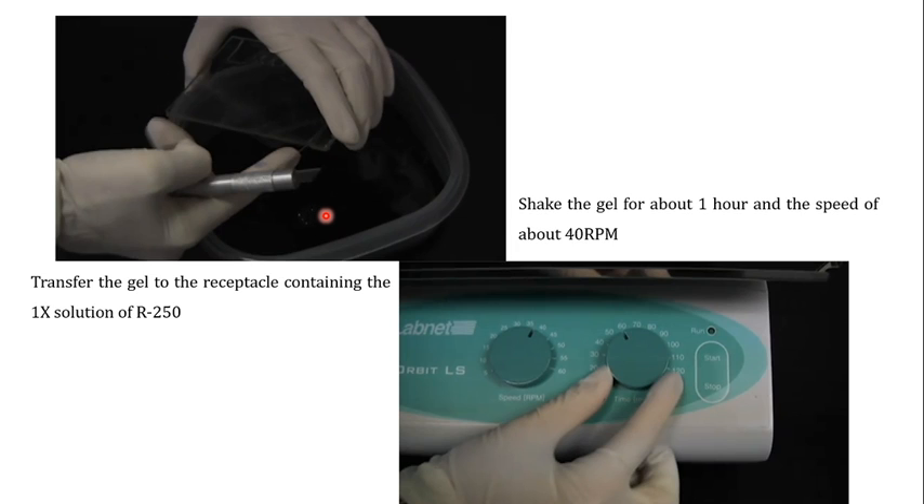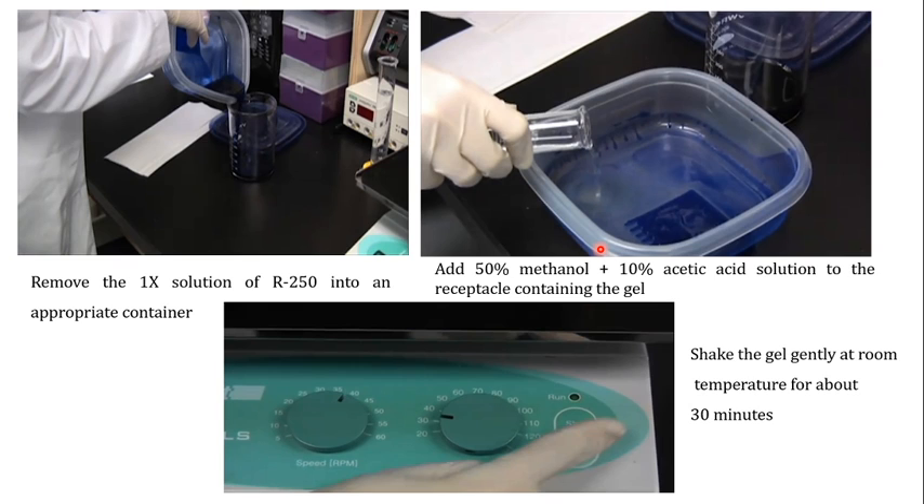Once the gel has been transferred to the 1x R250 solution, shake it for about one hour at approximately 40 rpm. Shaking allows the stain to interact with the proteins present in the bands. Once the stain interacts with the proteins, you get colored staining of the protein bands.